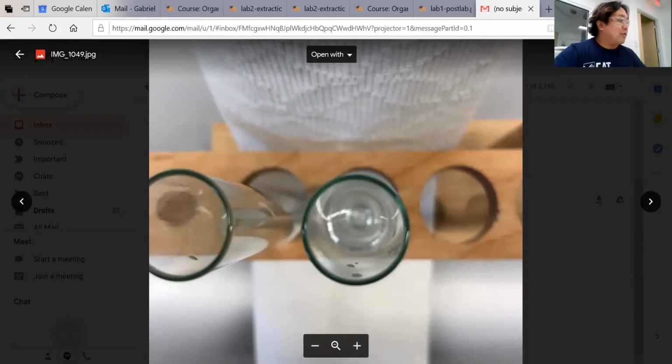Again, when I clean up all the organic solvents, cyclohexane goes into a separate container called organic solvents. The iodine and aqueous, the iodine in water, I probably won't put down the sink because iodine actually is a very good oxidizing agent, and I don't want to corrode any of the pipes. And also, even if the pipes are plastic, there's going to be a little bit of damage. So I'll have another container called aqueous waste, and this will be taken care of by environmental waste management.